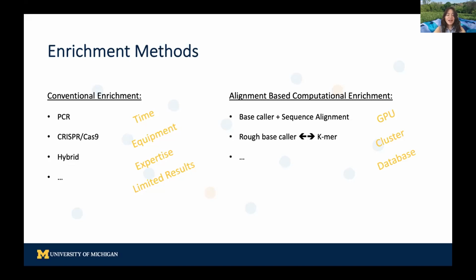We then turned our eye back to our Oxford Nanopore sequencers. Apparently, a nanopore sequencer can eject a partially sequenced molecule, a capability referred to as read-until. The read-until API allows selective sequencing of molecules by reversing the voltage of each individually selected nanopore and ejecting the unwanted molecules. The read-until API has the potential to computationally enrich the sample DNA or RNA content, saving the time and resources for only the targeted genome that we're looking for.